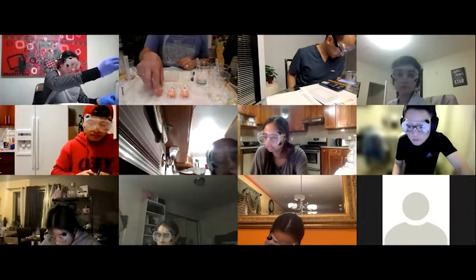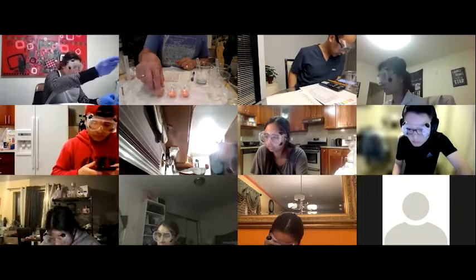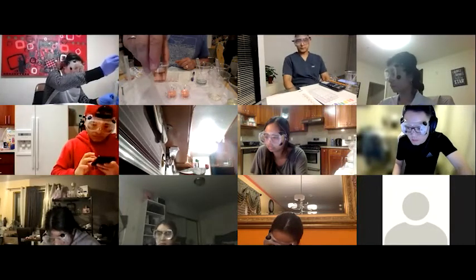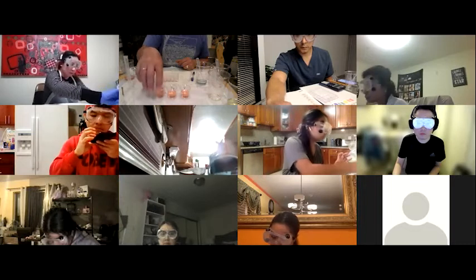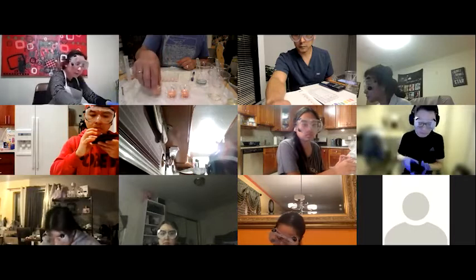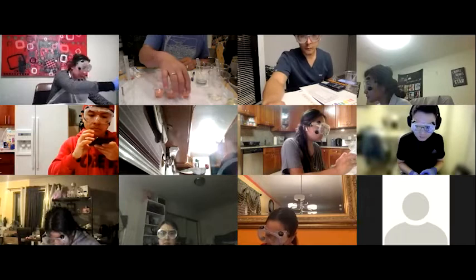These are all the same pH, but they're going to have radically different buffering capacities. Because this third dilution has 64 times less acetate ion and acetic acid than the original 4.7 pH buffer. So this should get overwhelmed at a much lower concentration of sodium hydroxide than the others. At least that's what I'm thinking.